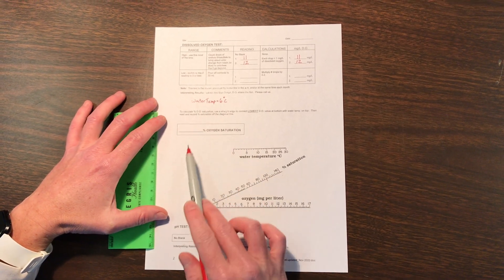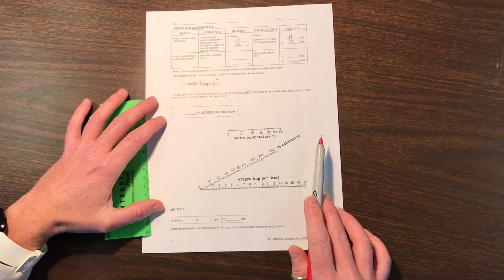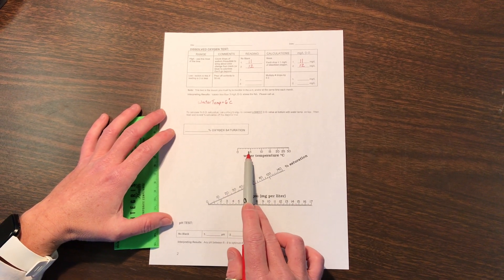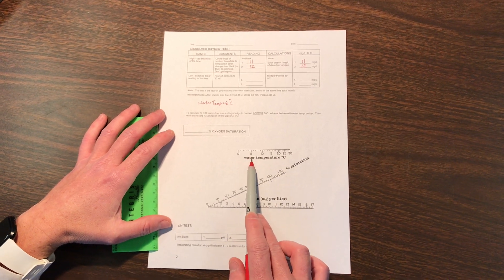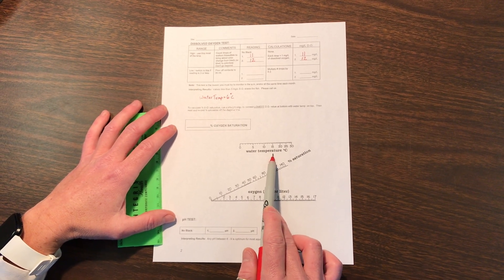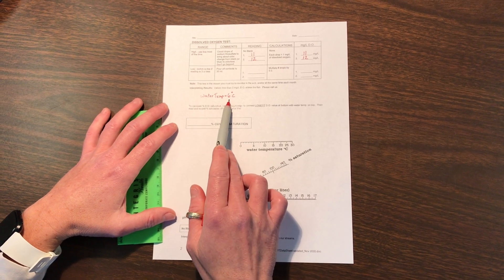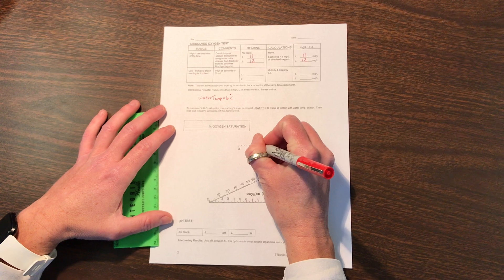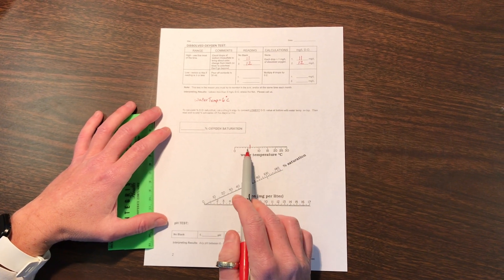Now to use this chart here on the center of page 2, this top axis line is for the water temperature. We want to make a mark at—we had our water temperature at 6 degrees Celsius. So we will make a mark there at 6.